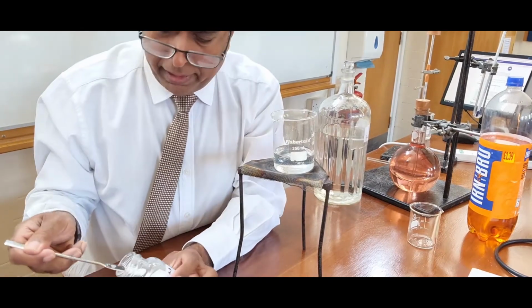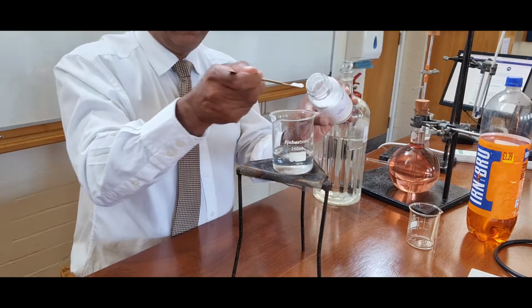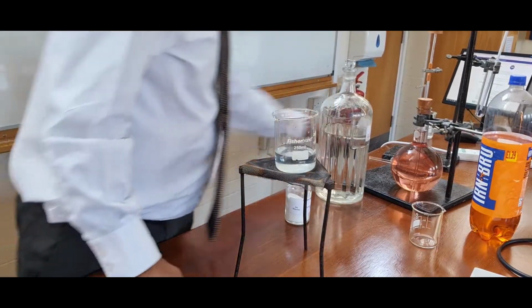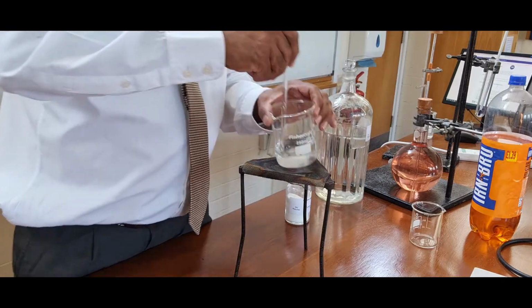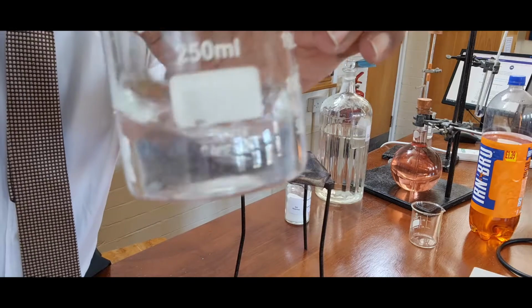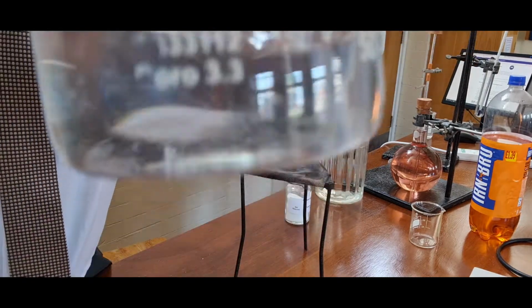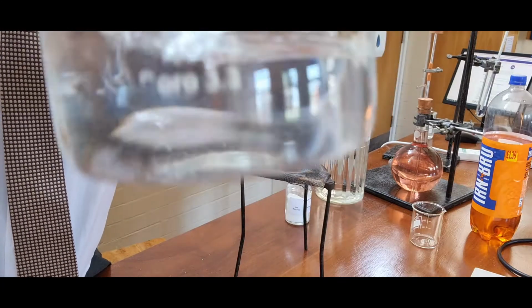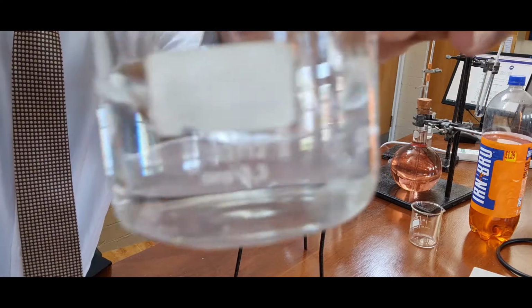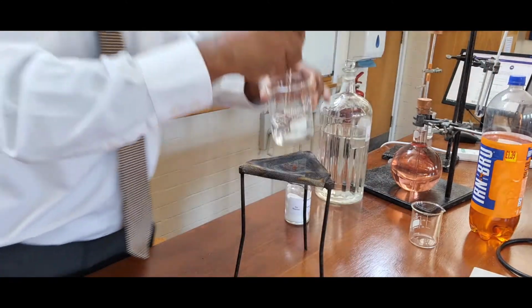So if I get a little bit of salt, sodium chloride, and put it in there with a glass rod, I can show you when I stir it, you can probably see the little pieces floating around. And as I stir it, those pieces get smaller and smaller until they completely break up.